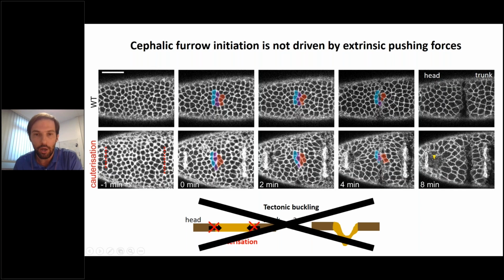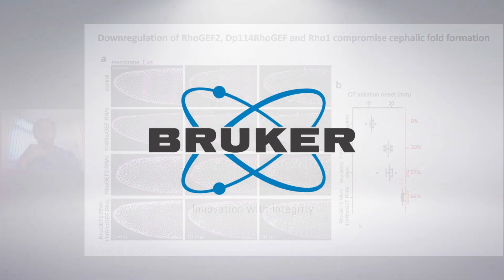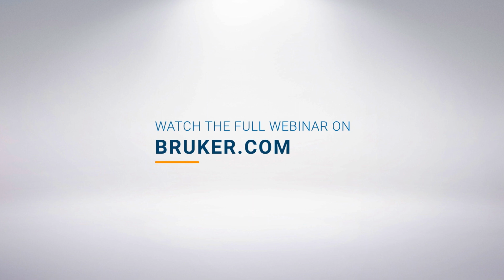Nevertheless, when we look at the time lapse, what we can see is that the cephalic furrow can still form, just like in the wild type. In addition, by forming, it can even rip the tissue away from the zone where the cells were stitched. And this really shows that the forces generating the cephalic furrow are generated within the furrowing region. Okay, this is the movie. So Anna then started to explore different Rho GEF factors that could eventually drive the formation of the cephalic furrow.